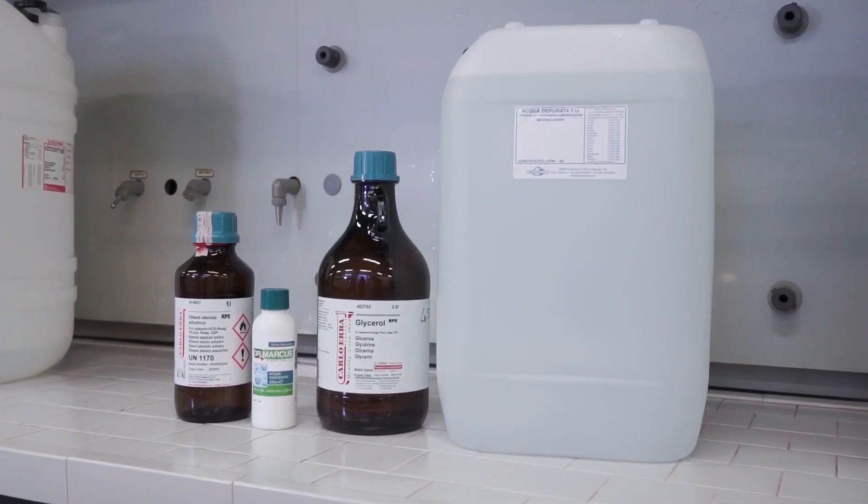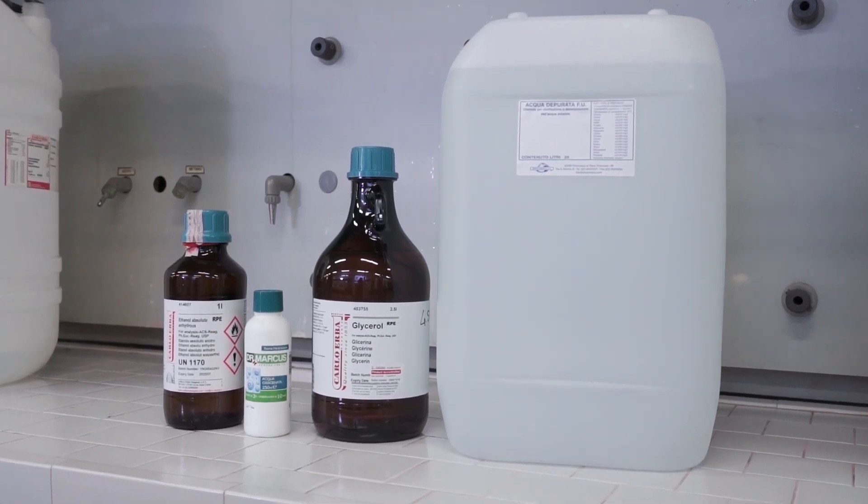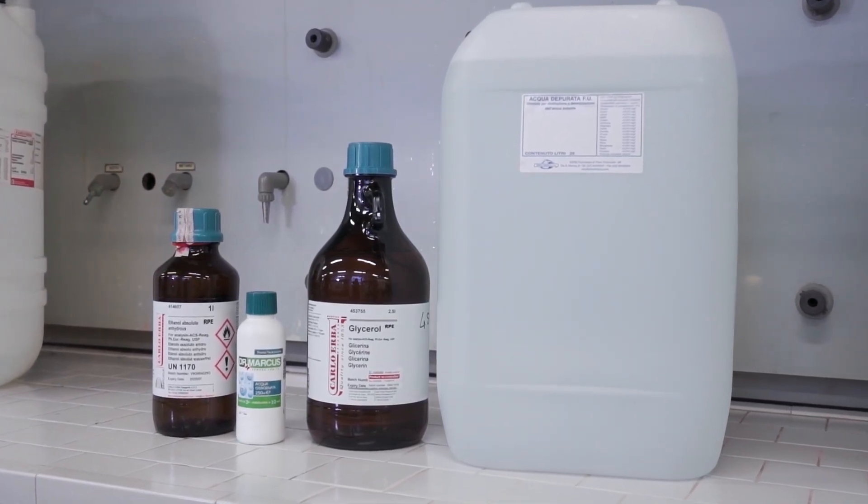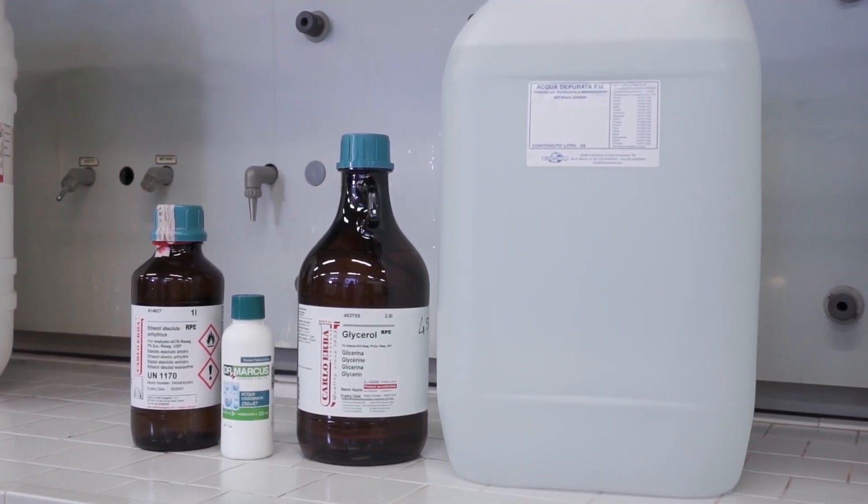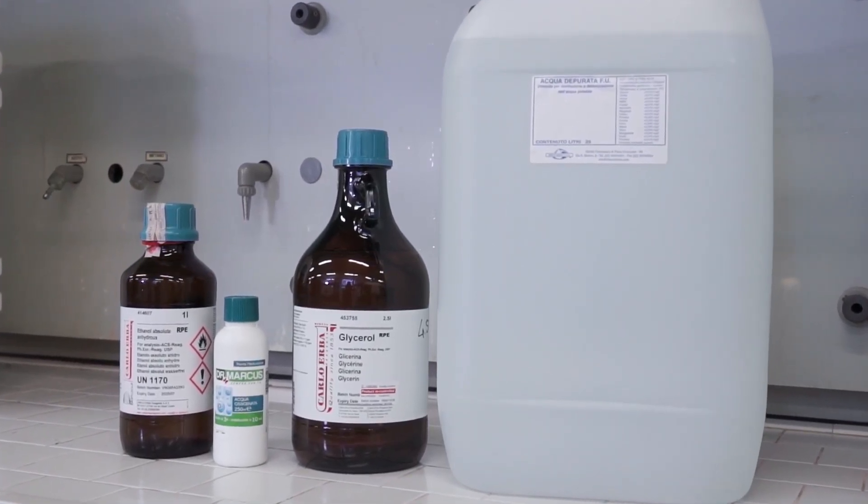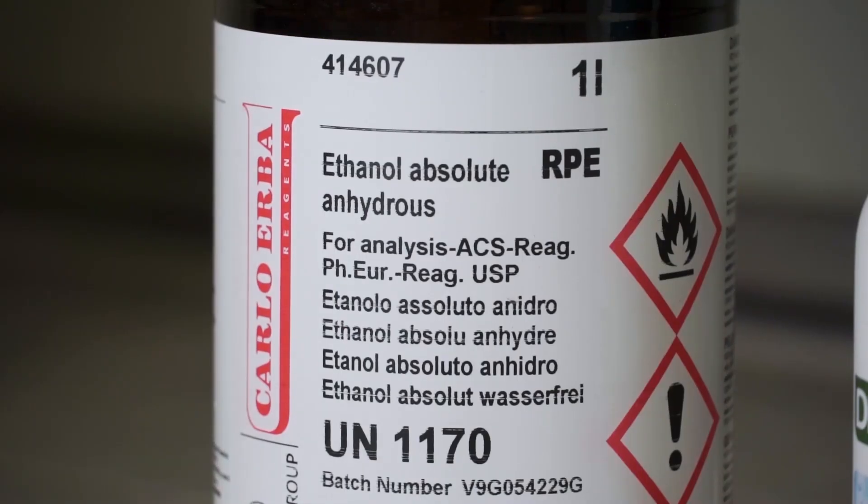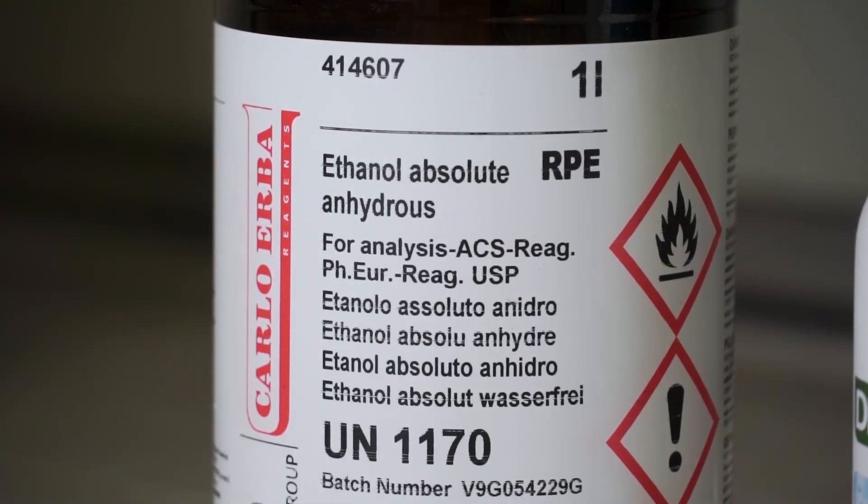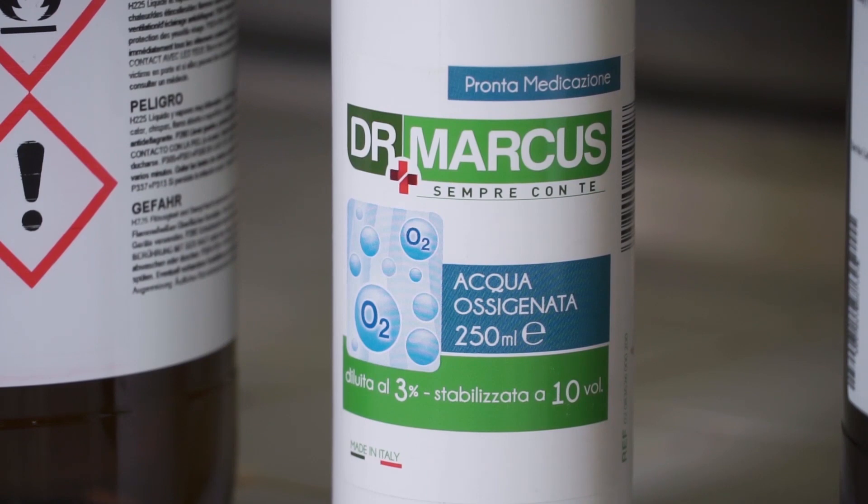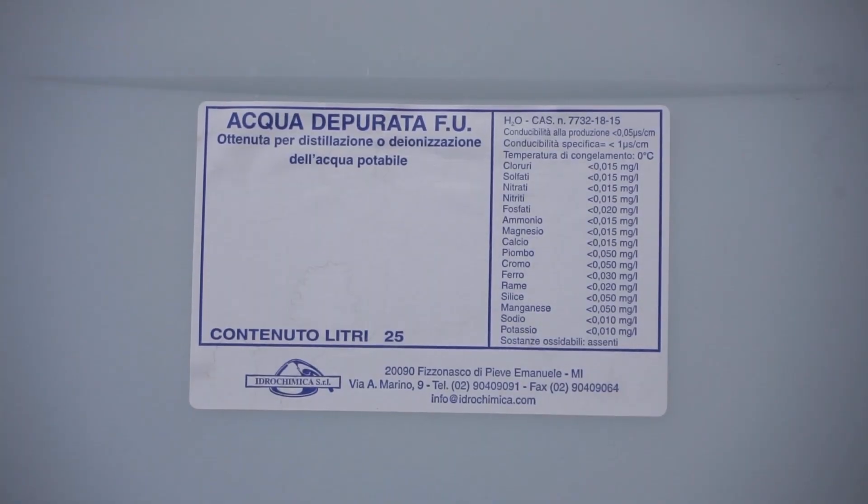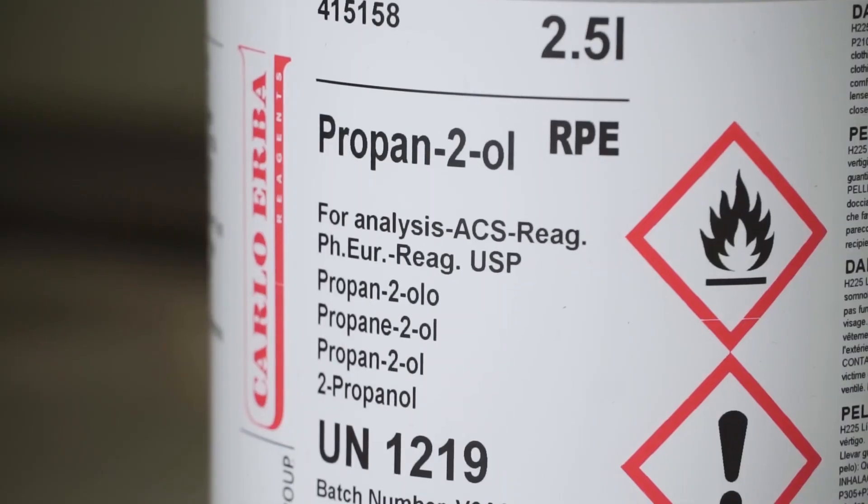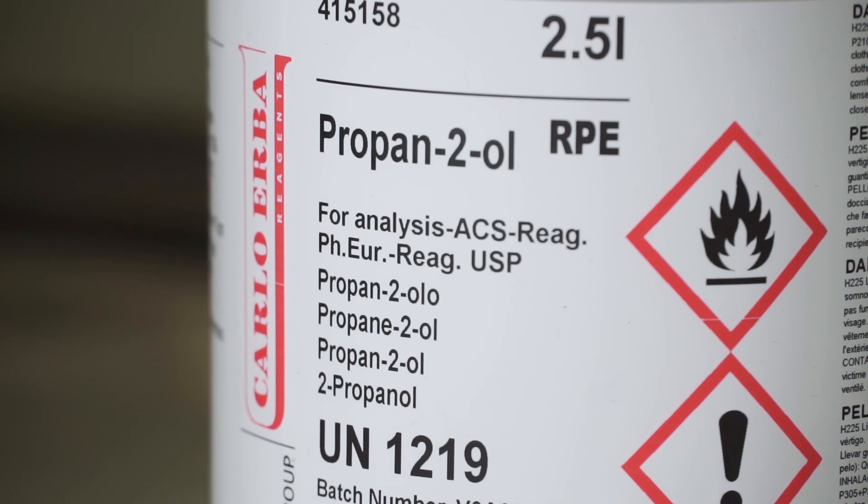The WHO has published two different hand disinfectant formulations, both listed in the attached document. The first formulation uses the following components: ethanol at 96% volume per volume, hydrogen peroxide, glycerol and purified water. On the other hand, the second formulation substitutes ethanol with 99.8% volume per volume isopropyl alcohol.